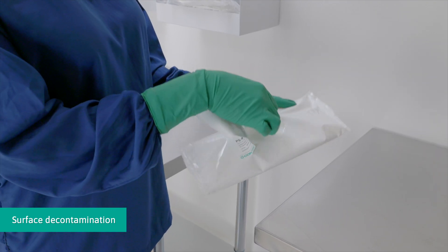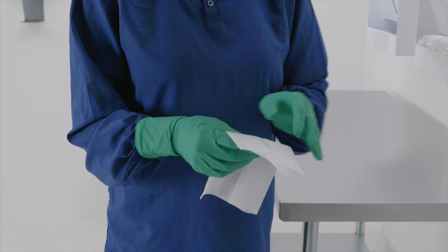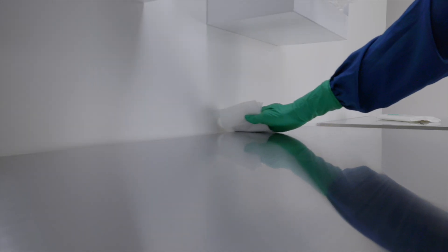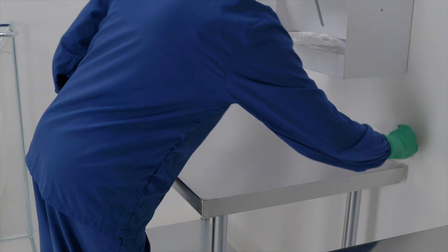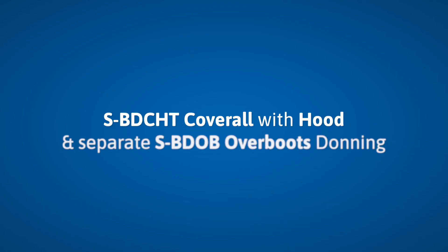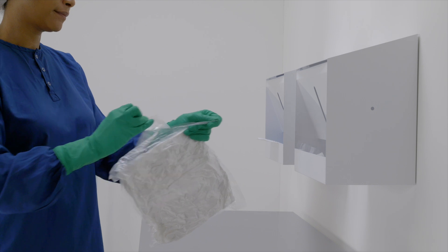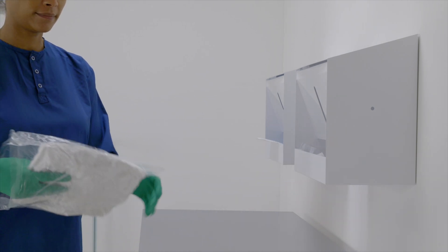Decontaminate the tabletop with sterile wipes, using a new surface of the wipe for each wiping stroke. Remove the coverall from the package, touching only the inner surface of the coverall.